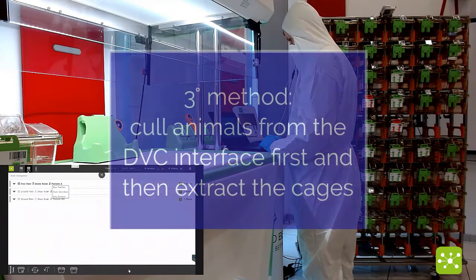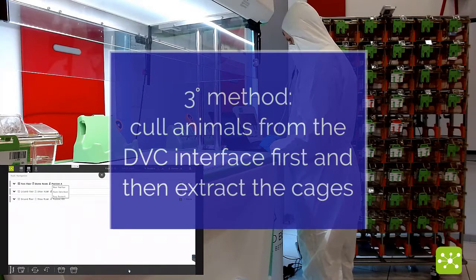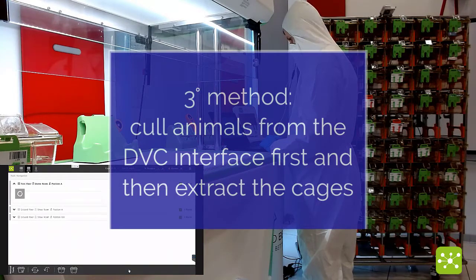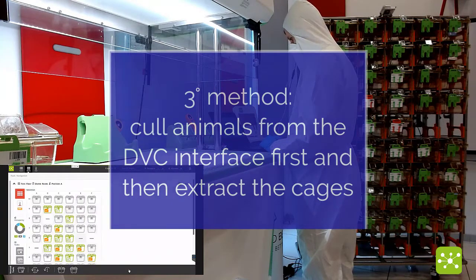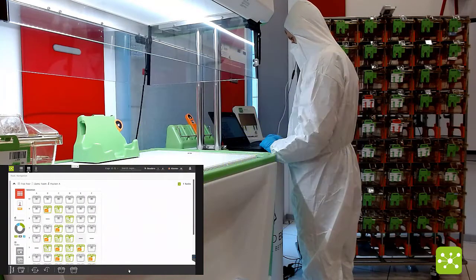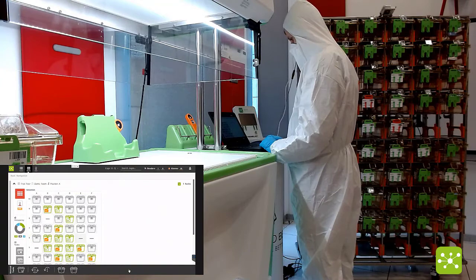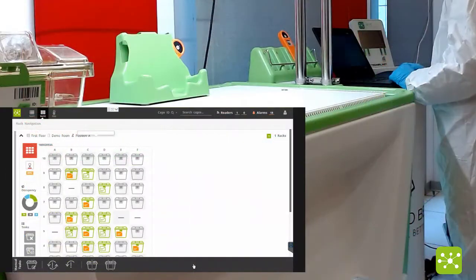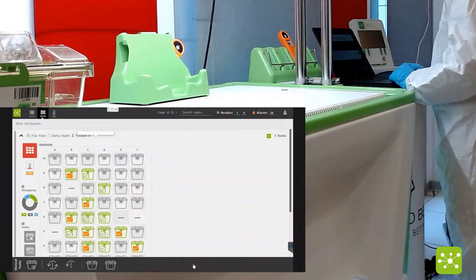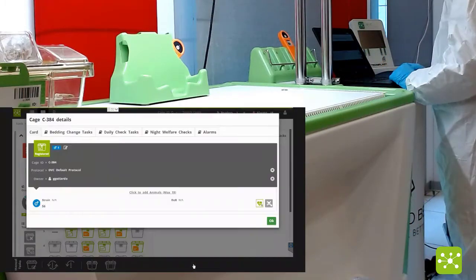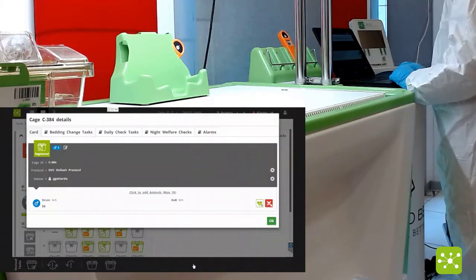The third way to eliminate a cage is simply opening the rack view in the interface, selecting the corresponding registered cage, and opening it in the interface.